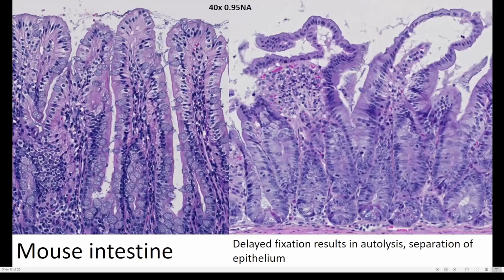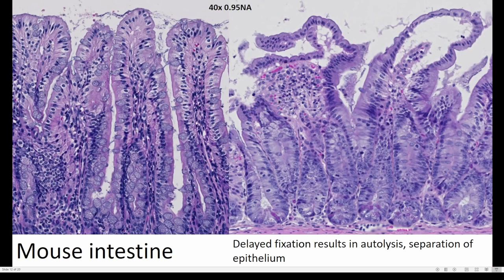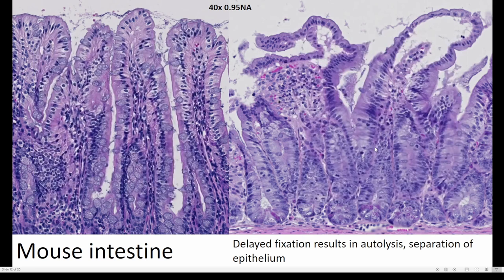Sometimes tissues don't stain with eosin, probably due to massive protein loss. In a mouse intestine example, the left side shows a nice brush border, visible cell membranes, and interesting nuclear structures, whereas on the right, all of these are disrupted. The delay in fixation resulted in autolysis, and the epithelium has separated from the lamina propria.